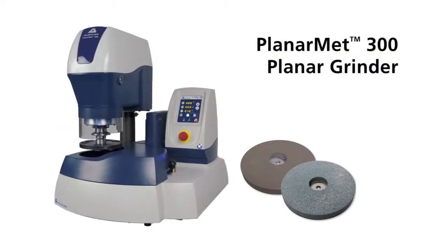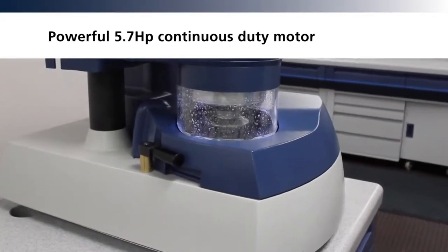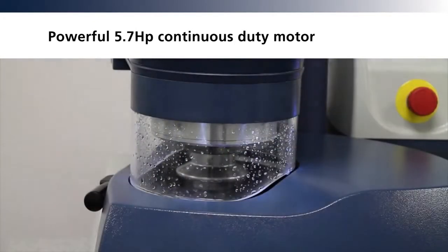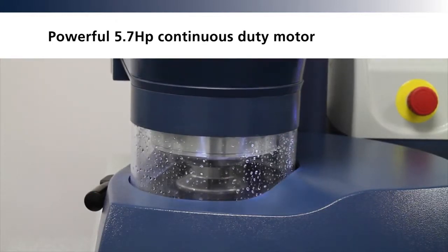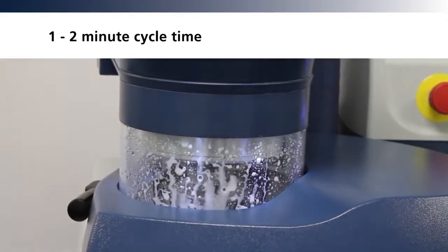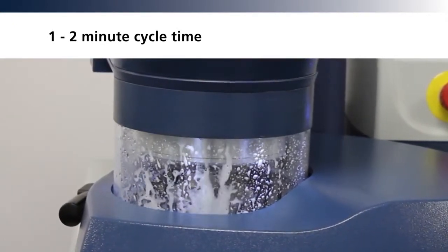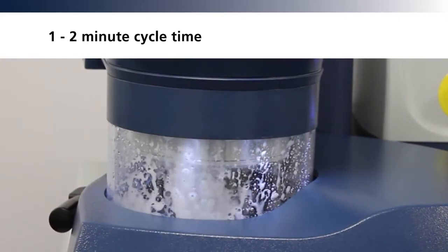The Planermet 300 Planar Grinder. Efficient, accurate, and fast. This powerful benchtop planar grinding machine utilizes a fixed abrasive stone for rapid specimen grinding. Quick cycle times of one to two minutes provide flat plane specimens, replacing all other abrasive grinding steps.